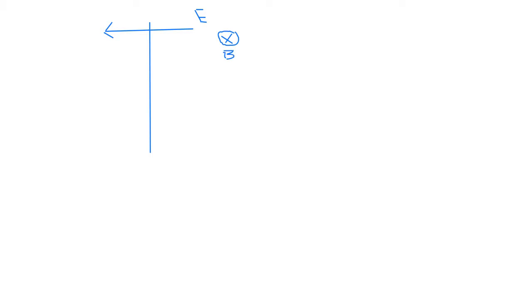You can always apply the Lorentz law to get the right direction. What I would like to highlight here is the basic principle of the mass analyzer.